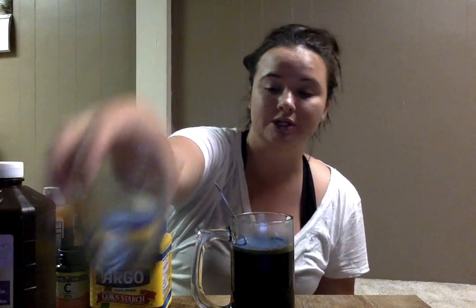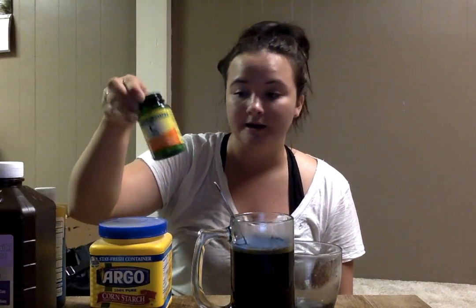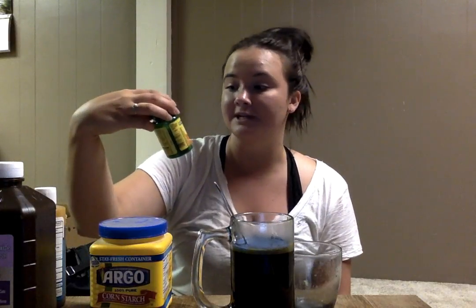I think I had 40 seconds on my timer going, which is extremely slow, and it's cool that we can watch that happening. Even with the solution A, when I poured the iodine with my vitamin C, I was unsure because this has additives in it, which he said you didn't want, so I was kind of nervous about that.